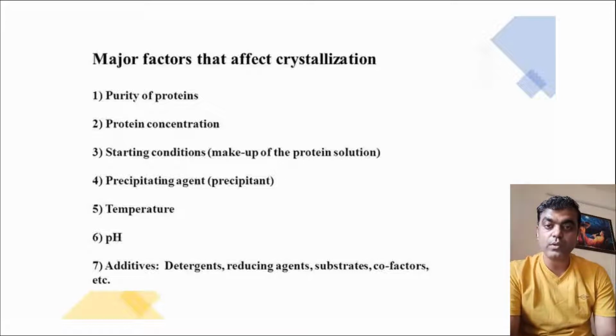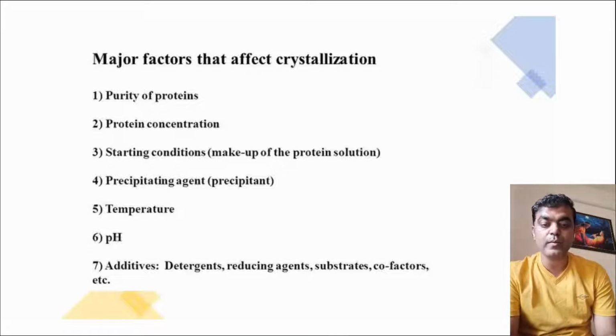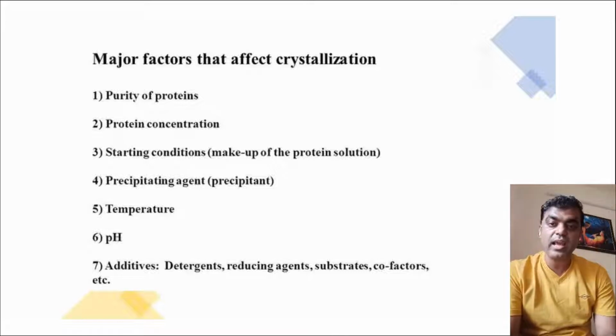And as and when isolated, there should not be any sort of contaminations, either with any sort of metal ions or anything else, and then this protein should be dissolved in the particular solvent or the buffer and then used for protein crystallization.